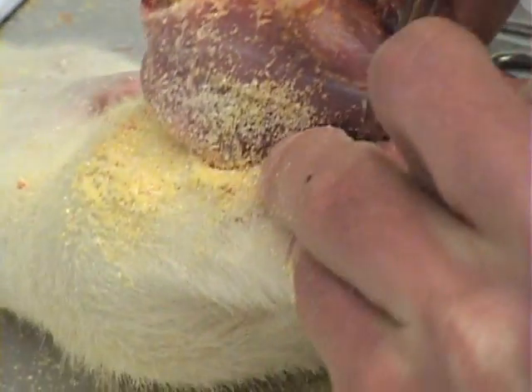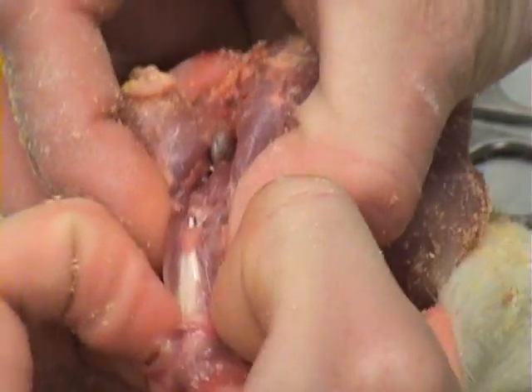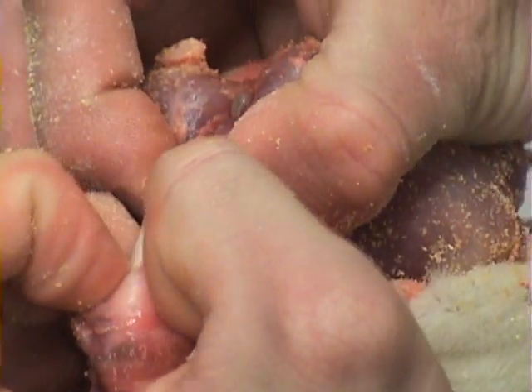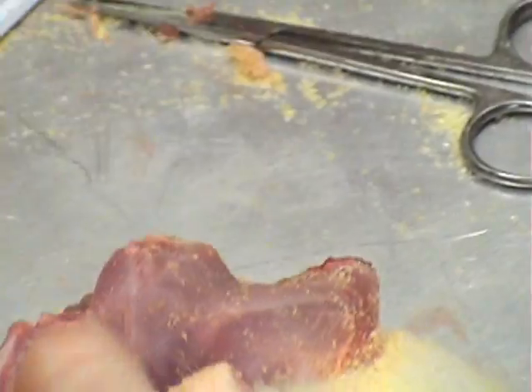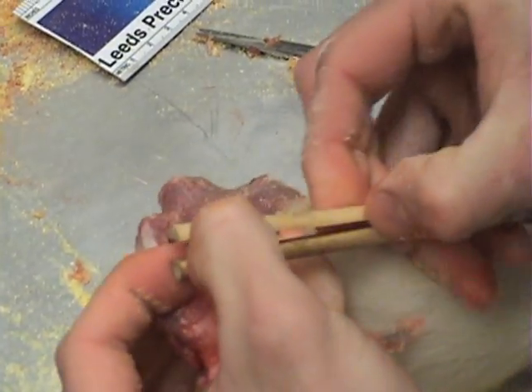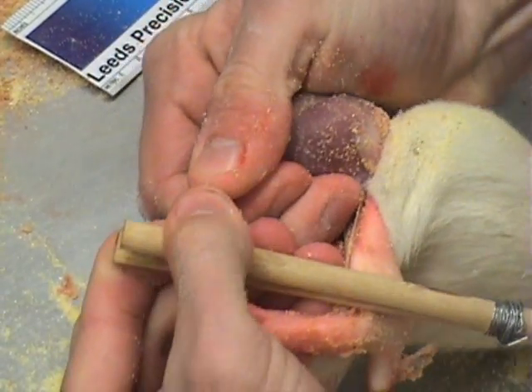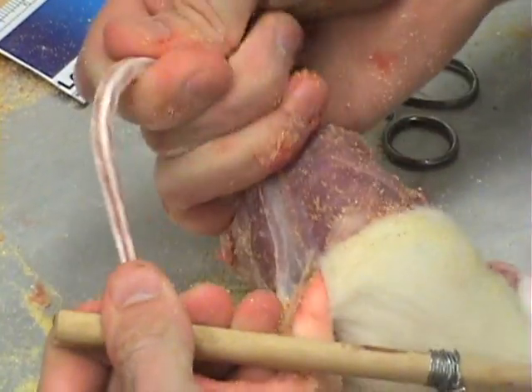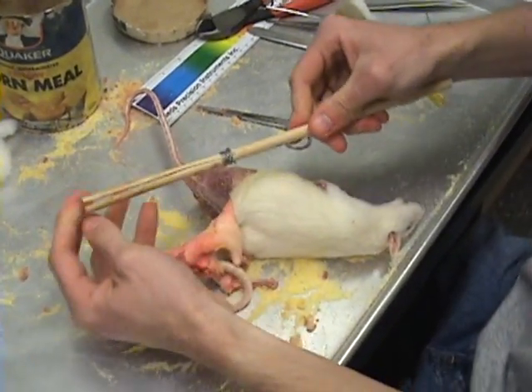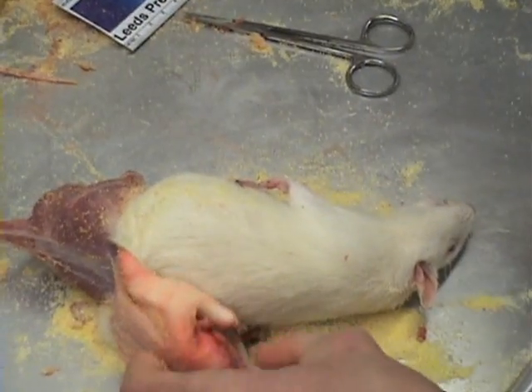At this point the tail will need to be stripped. For smaller animals, mouse size, the fingers and a firm grip should be sufficient to remove the tail. For larger animals, rat or squirrel size, a tail puller comes in handy — this is simply a split stick that helps to force the tail off. For animals such as a muskrat, the tail will need to be split on the ventral side and sewed up later.